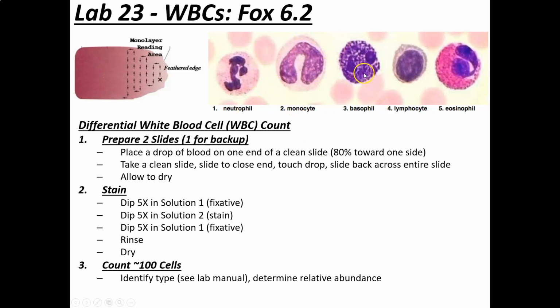The basophils are the least numerous blood cells that we see. They're called basophils because they have these dark staining granules. So they're a granulocyte because they end in the name phil. And they have these dark staining granules. That's where baso comes from. And sometimes it's hard to see the nucleus. We can see the nucleus in this picture, but oftentimes the granules are so consistently dark that it's hard to see the actual nuclei, so they're said to be occluded.